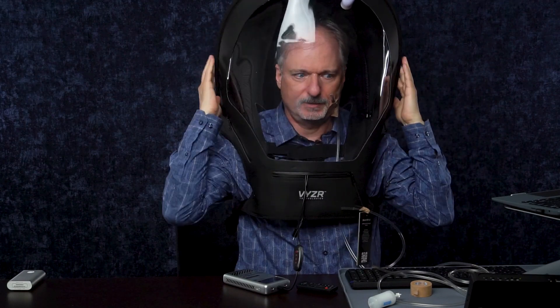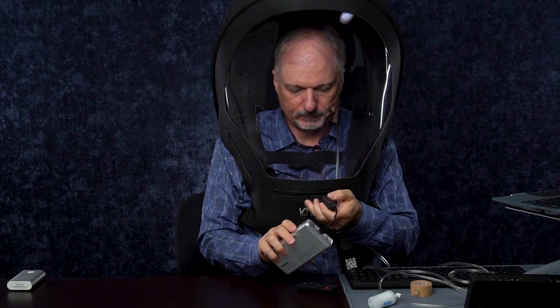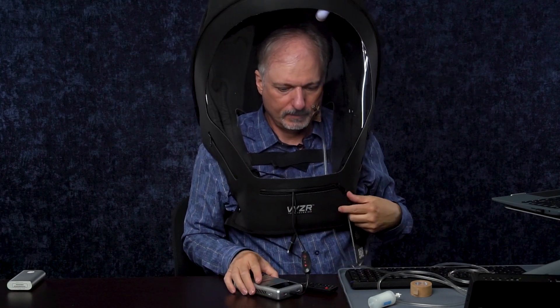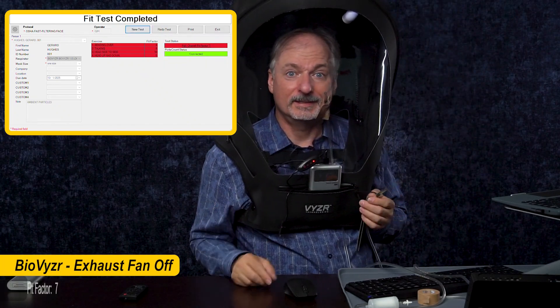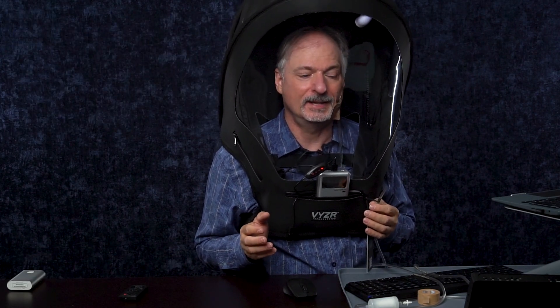Next, let's see how it actually tests. I've got the Biovisor on — it's not especially comfortable, doesn't really fit over my shoulders, it's kind of flattening against my face a little bit, not as roomy as you would expect. I'll turn on the battery and crank it up to full airflow rate, leaving the vent fan unplugged for now. The scores are in: fit factor overall of 7. That is way less than an N95 — you have to get 100 for an N95 to pass. This is not doing that.